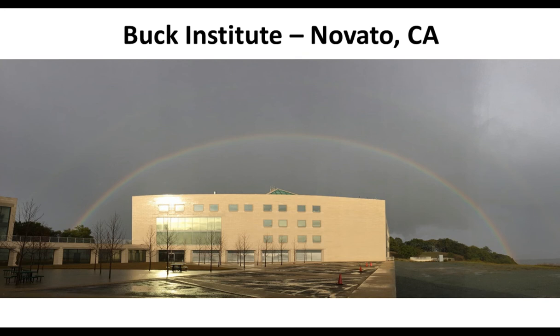The one thing that one might consider is just the case that maybe at some point the mixtures do not get too complex, because one reason why we do these enrichments is that we can focus most of our mass spec time on the enriched PTMs. But on the other hand, that is usually not such a problem. When we look at PTM-enriched fractions, they're usually really not that complex, and with the modern mass spectrometers, they are so fast scanning and have such good sensitivity that I see this to be actually a really interesting trend for the future.